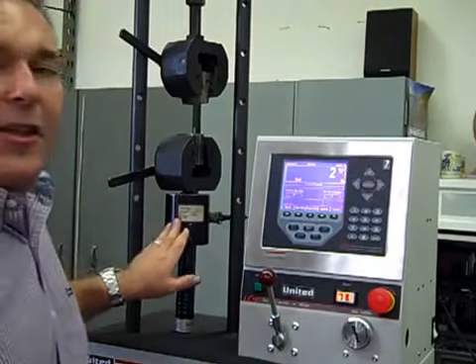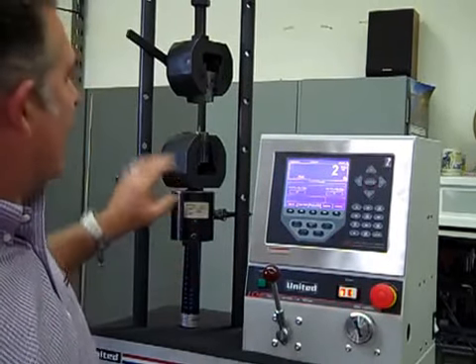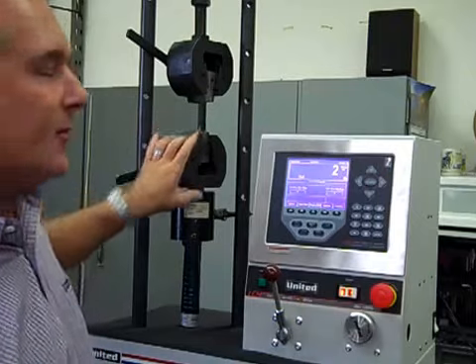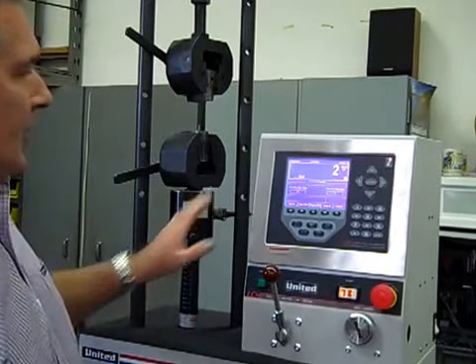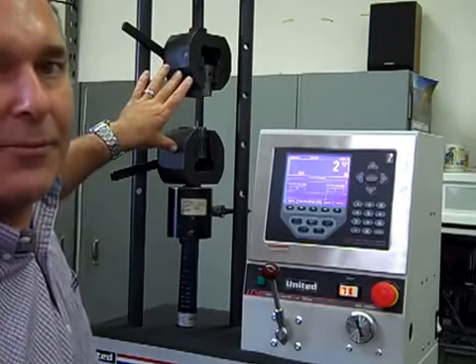However, the end user could use any capacity load cell, and they could use any types of grips and fixtures. This system here is featured with a digital readout, a load cell, and a pair of wedge grips.